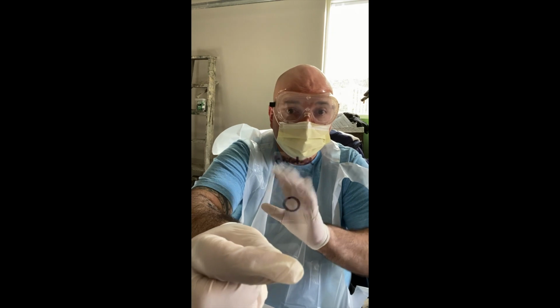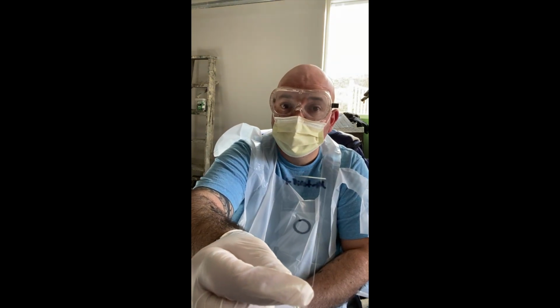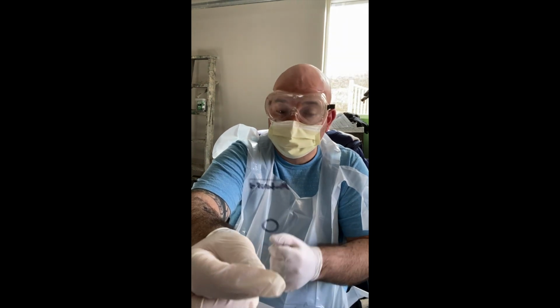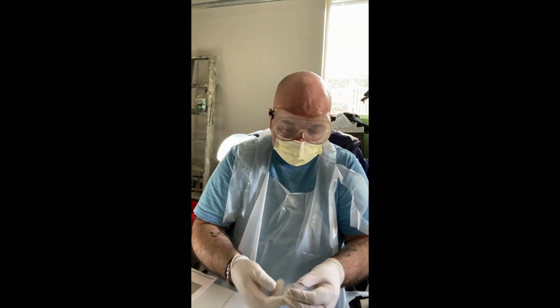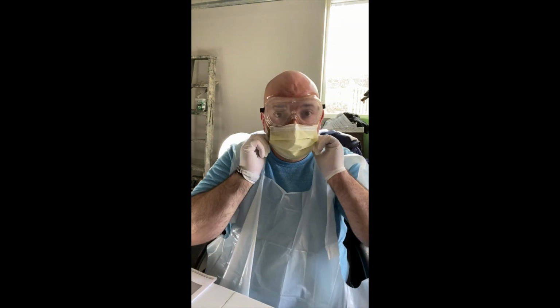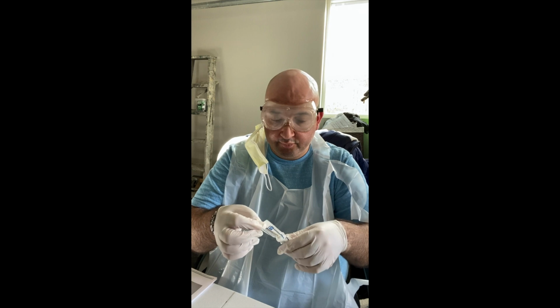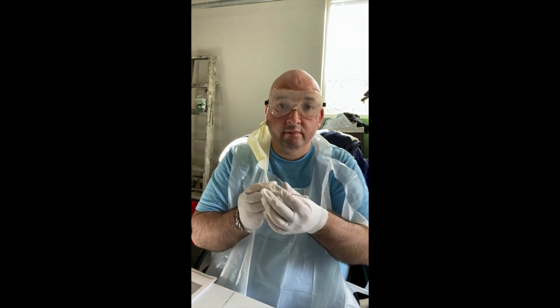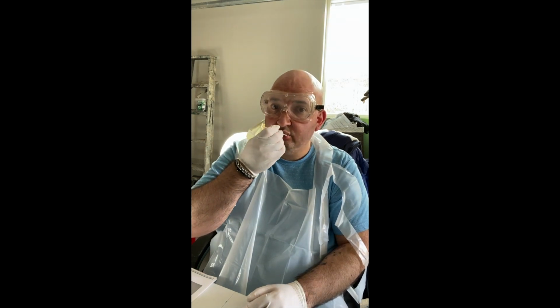I've already, just to preface this really quickly, cleaned my surface with my 10% bleach solution. So I'm now going to go ahead and remove this face mask and collect my specimen. So I'm just going to put this slide here on my paper towel. Just take this off for a minute here, and then pull one of these swabs out. Okay, and I'm just going to rub it here, like in a previous video.